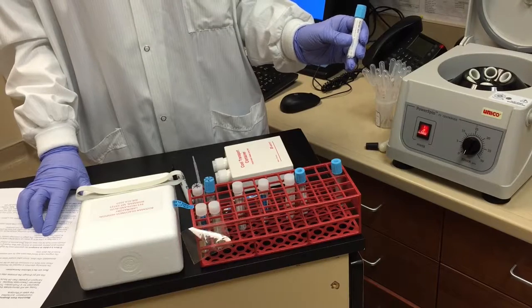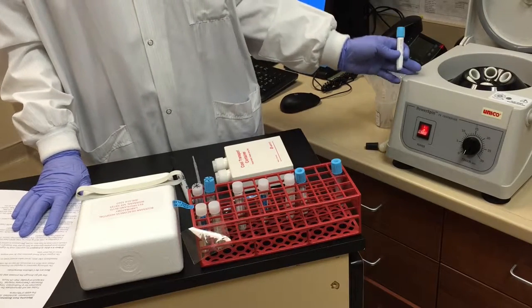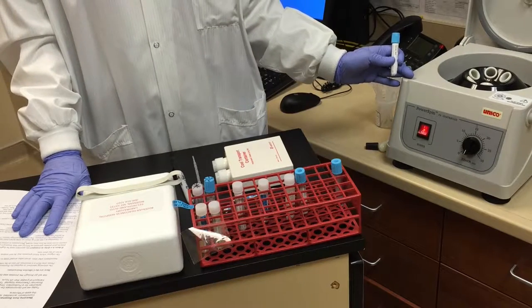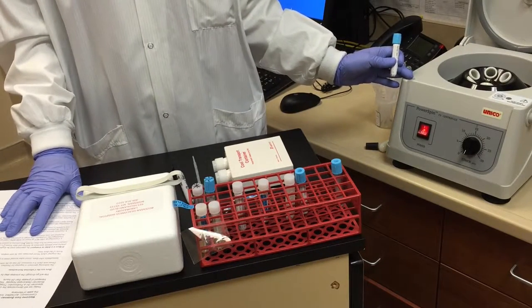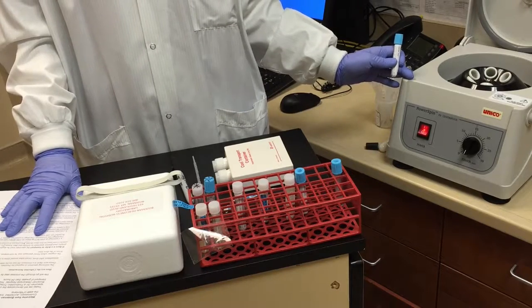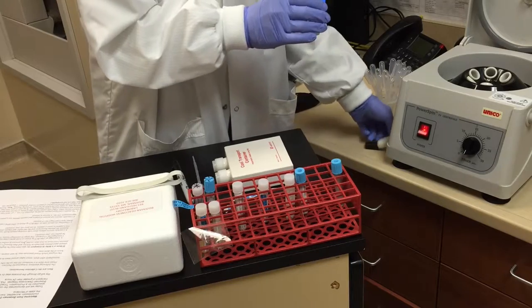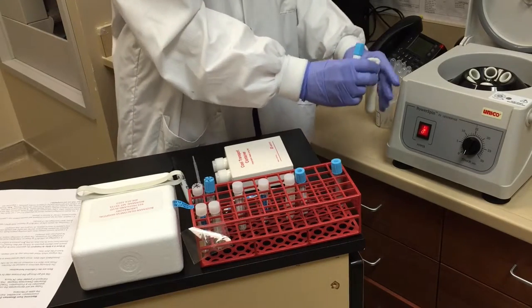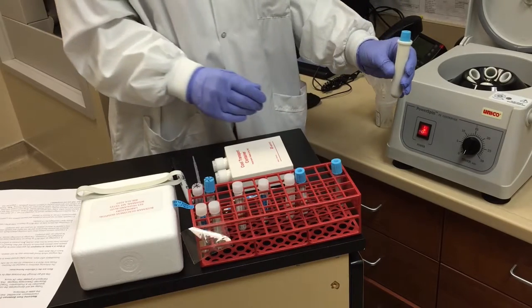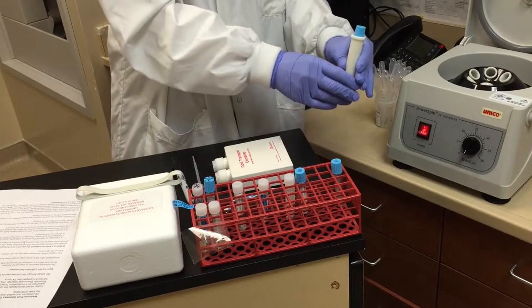We will centrifuge at 1500 RCF or 3200 RPMs. For the Unico FX power spin centrifuge, it is required to spin at 3400 RPMs for 15 minutes. We'll use plugs in the inserts if needed so we can easily remove the tube from the insert.